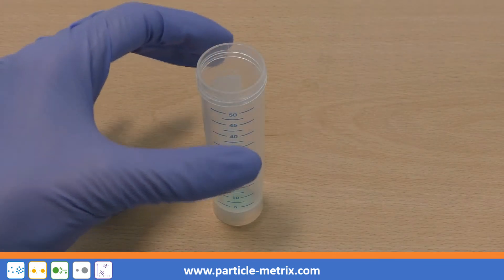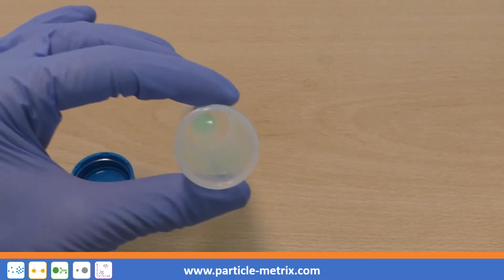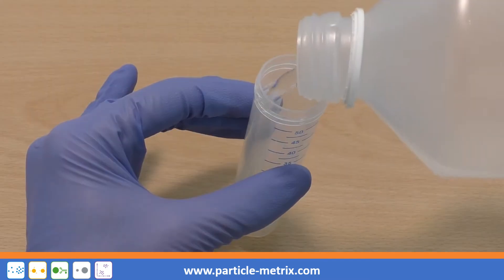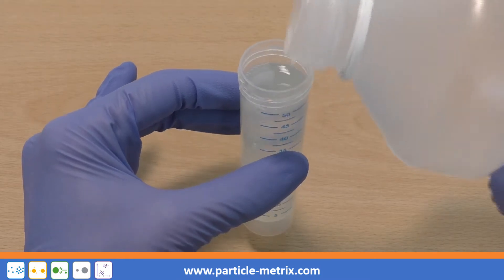To clean the measuring cell, first put a few drops of green or blue cleaning solvent in a container. Then add water and mix the solution well.